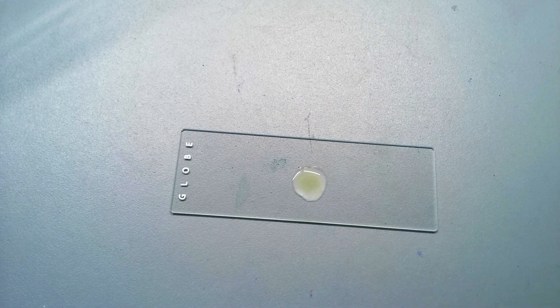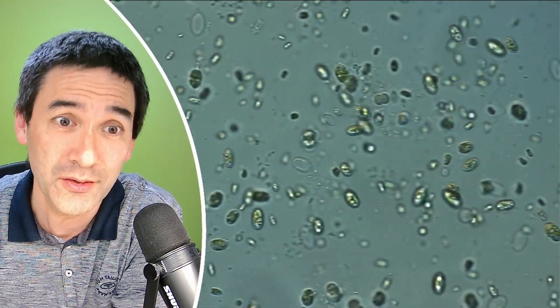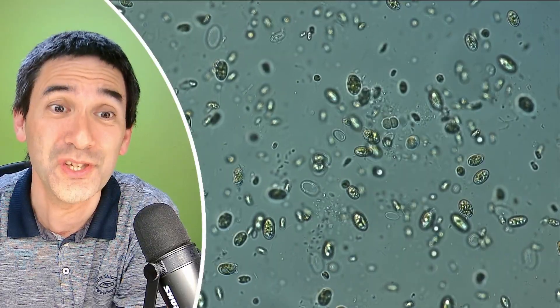And this is what I got here. I'm actually quite happy that so many cells survived this procedure.